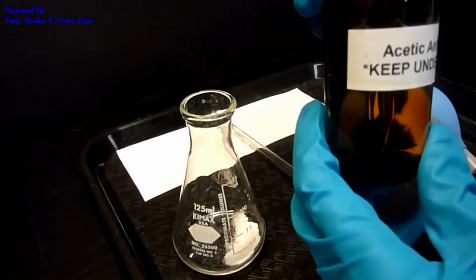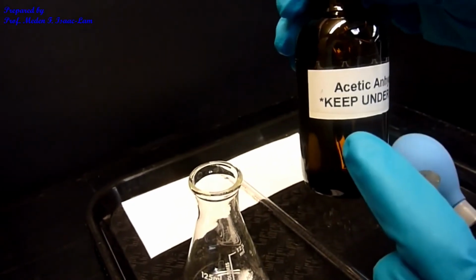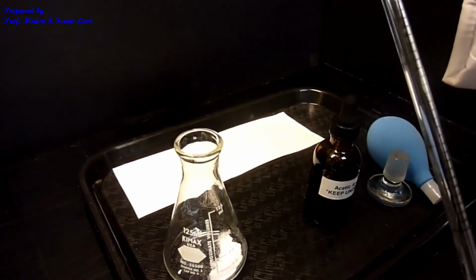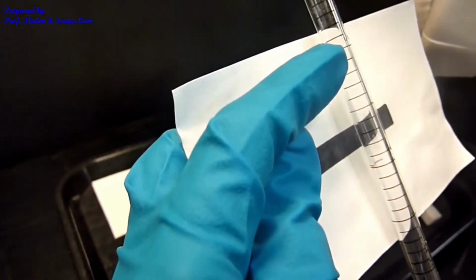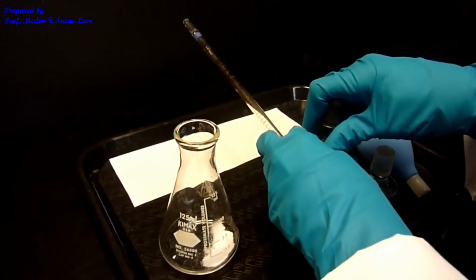So the other reactant is acetic anhydride, and I'm actually under the hood, and I'm going to be using a straight pipette. So I'm gonna deliver 1.4 ml. So I can go up to 3 and then go down to 4.4. So I need 1.4 ml of the acetic anhydride.